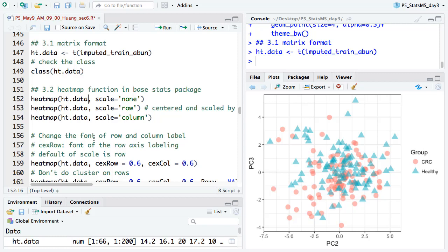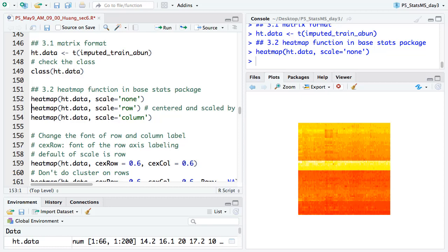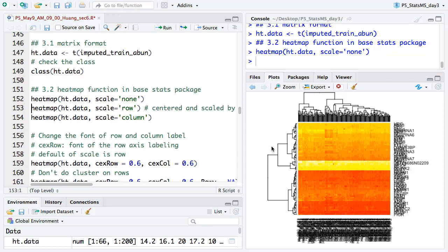So that's how the heat map looks like. Each row is one protein and each column is one sample. I changed the column and row orientation. Here we run the heatmap with no scaling parameter — scale equals 'none.' The problem with no scaling is that different proteins have very different ranges of abundance. So proteins with low abundance versus high abundance will dominate the color scheme, and it's hard to see differences between samples.